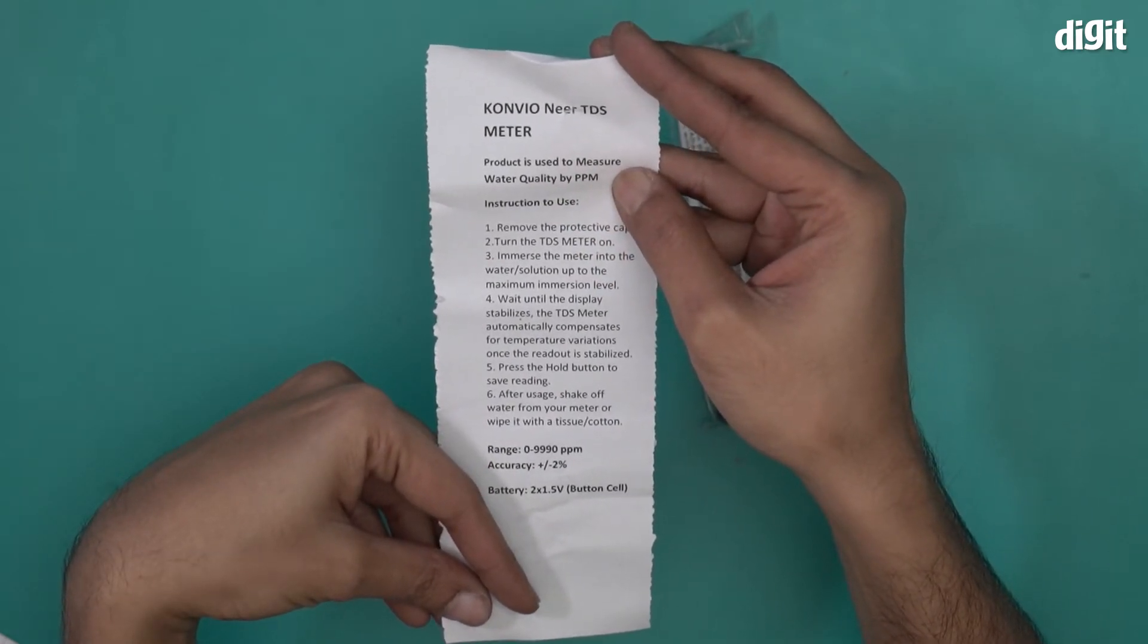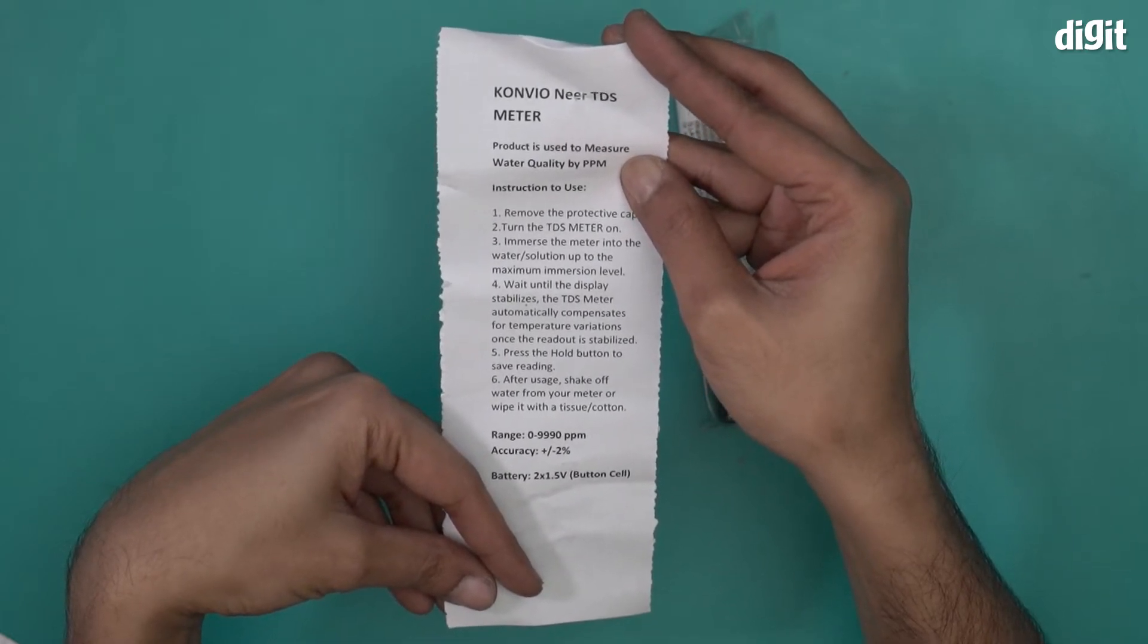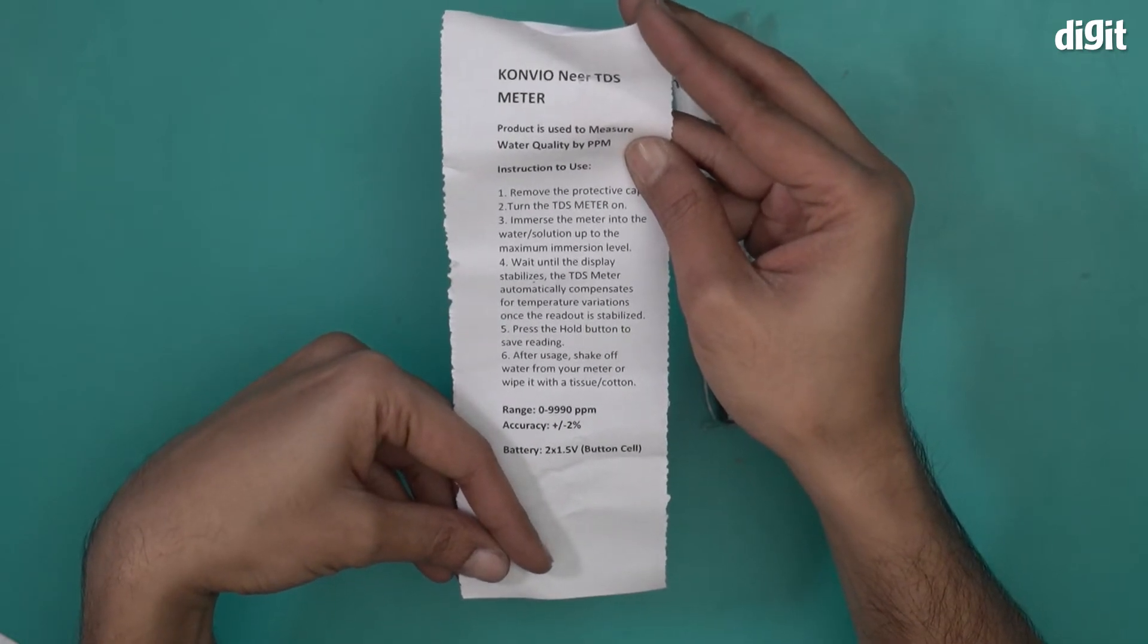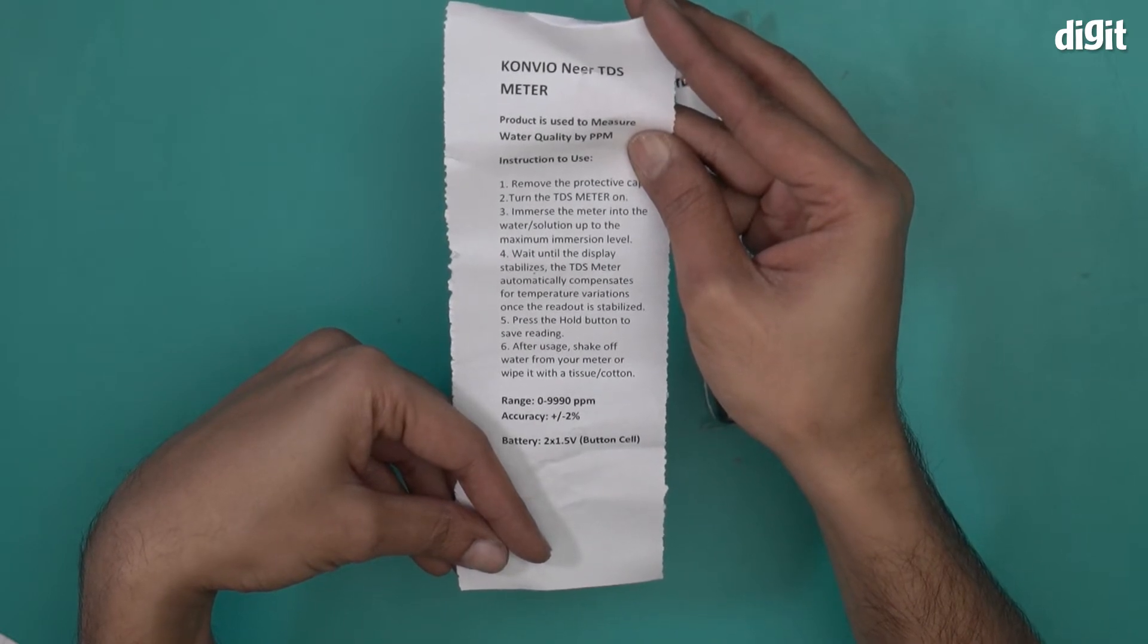Remove the protective cap, turn the TDS meter on. Immerse the meter into the water solution up to the maximum immersion level. Wait until the display stabilizes. The TDS meter automatically compensates for temperature variations once the readout is stabilized. Press the hold button to save readings.